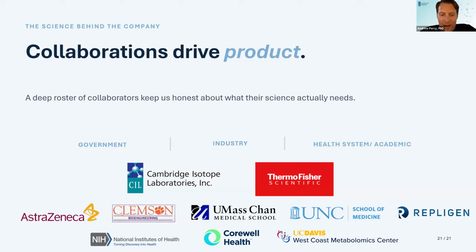Sounds great. One more question I'll ask before moving on. How much time does it take to get this kit up and running in the lab, from box to bench, etc.? Yeah, and I'd be interested to hear Caroline's experience with this actually. But in most labs, it's within a day. The first thing you would run is set the method up and run the SST. Typically, most labs were able to do that the first day, and then they're able to collect their data very shortly thereafter.